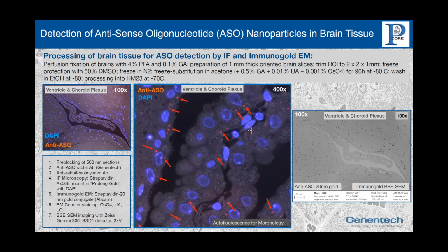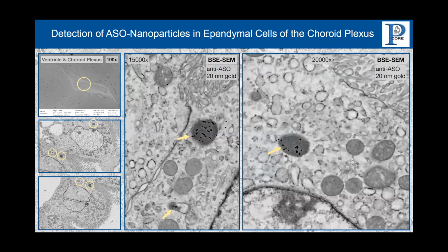Now, because we can use a very wide field in the scanning EM, I use this information to guide me of where to look with the scanning EM in this brain region. Like I pointed out, the fluorescence microscopy helped us to find the correct brain region. We use this wide field to find this correct brain region, and now we zoom in the scanning EM until we see these cells at an individual level.